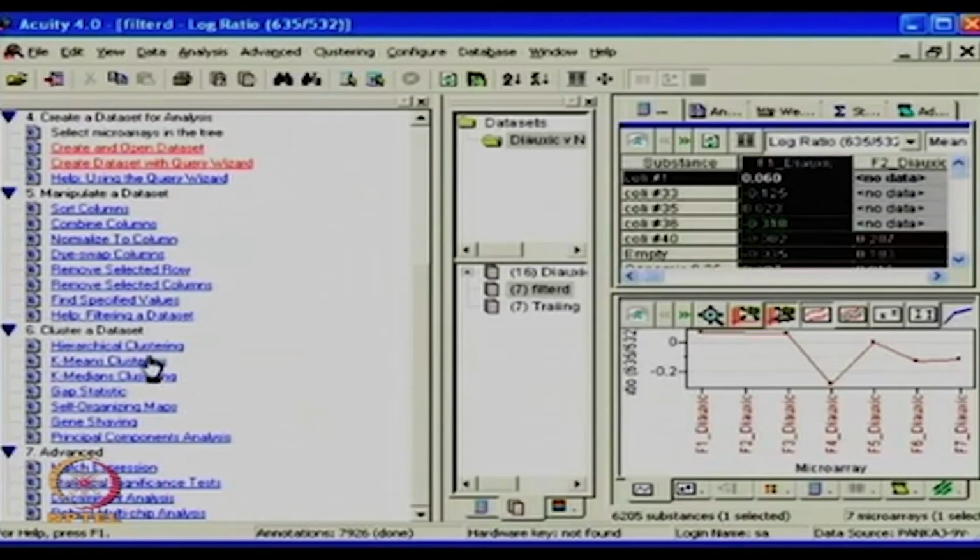Technically the clustering is divided into two types, hierarchical and non-hierarchical. Hierarchical means that in the starting you have only one start point and then all other features are attached to it. The other one is the non-hierarchical type, where each group behaves independently of each other. So there are k-means, SOMs, k-medians, and people use hierarchical when they don't know where to start. So they start with hierarchical when they don't know how many groups could happen and how many results I am expecting.